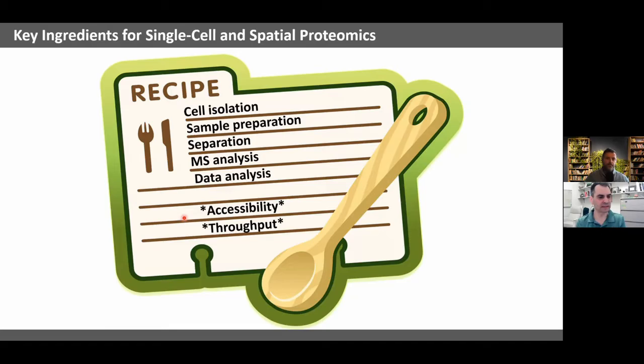And so I'll be focusing on label-free analysis in this talk, but the tandem mass tag approaches such as SCOPE-MS also work well in the nano processing format that I'll be describing.